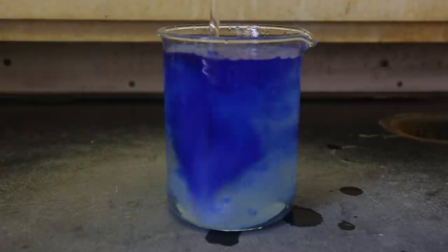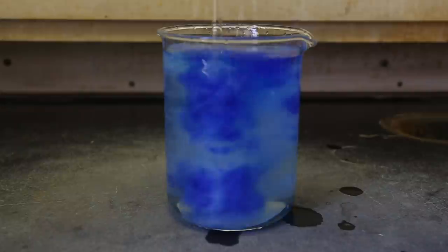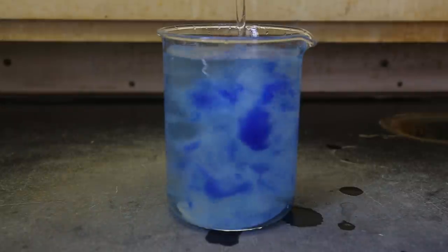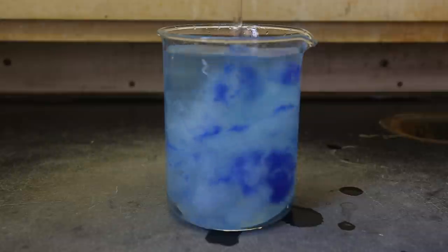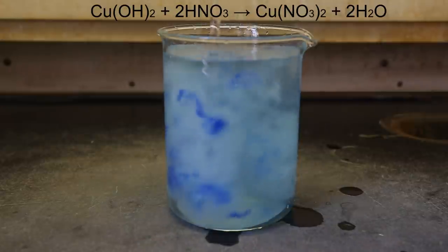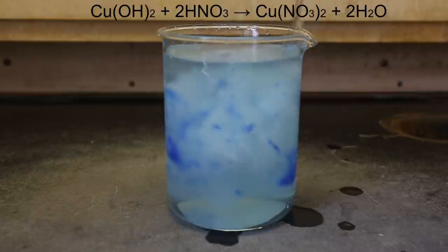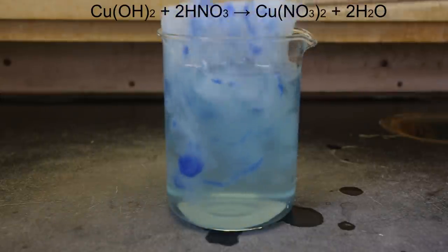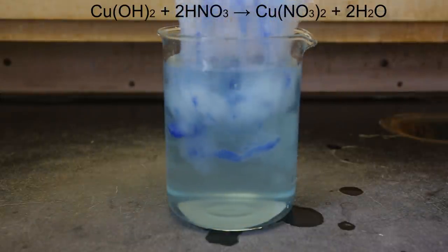Eventually, most of the Schweizer reagent was neutralized. Like the sulfuric acid solution, the solution slowly took on a faint blue color. This is due to the formation of copper nitrate as shown in the reaction above. Like with the other acids, the nitric acid reacts with the copper hydroxide to form its corresponding salt. Like copper sulfate, copper nitrate is blue when dissolved in solution.